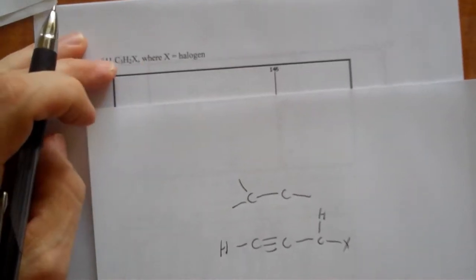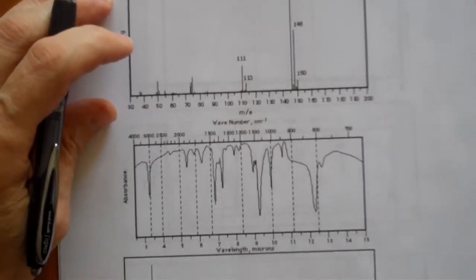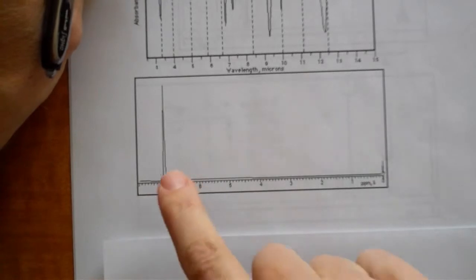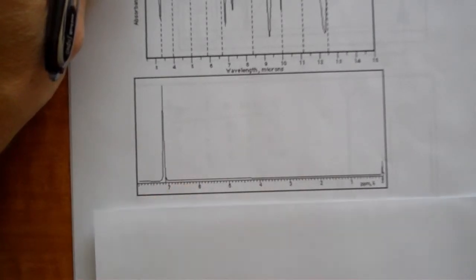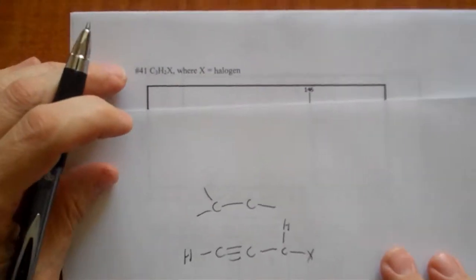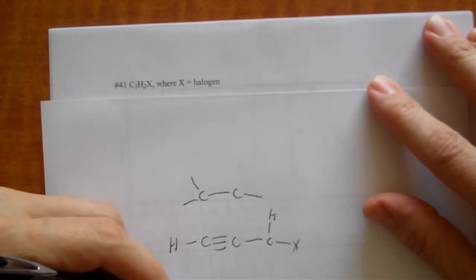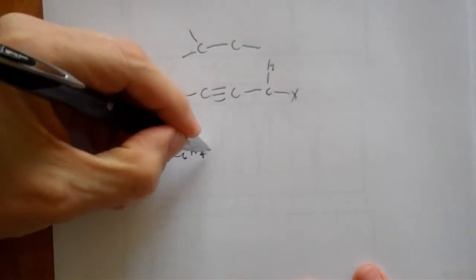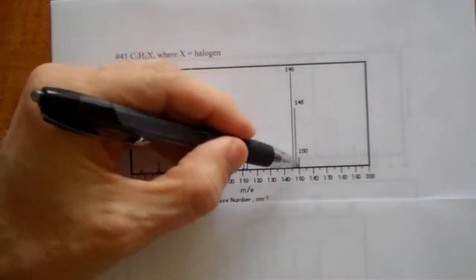It just about has to be C6H4. But look at this. Let's take a glance down at the spectrum. Aha! It's between 6.5 and 8, and it's a single peak. So that means all the hydrogens are the same, and it also means it's aromatic. Okay? So we automatically know we're going to be going to C6H4X2, and it looks like both the X's are the same. Alright, and that would account for this weird pattern here.